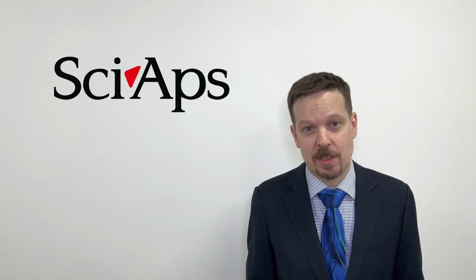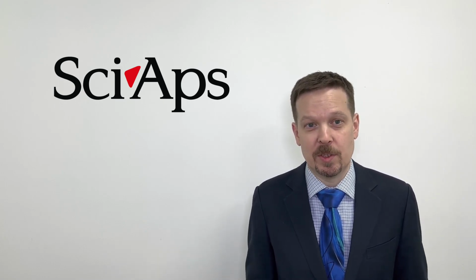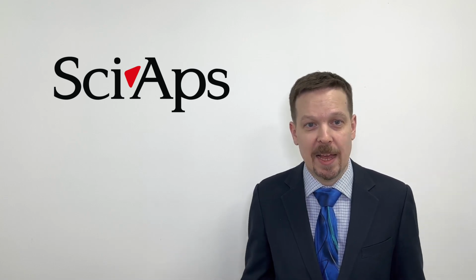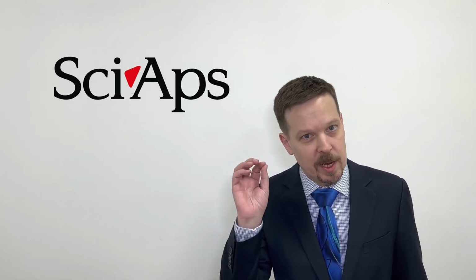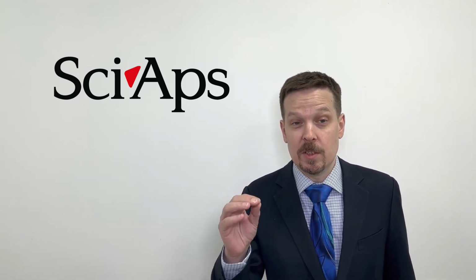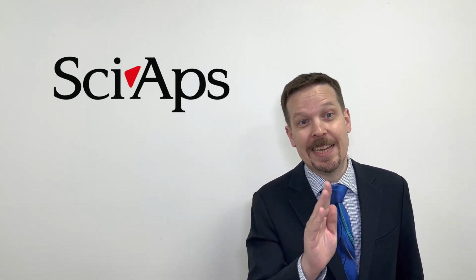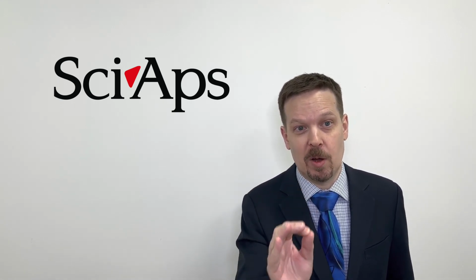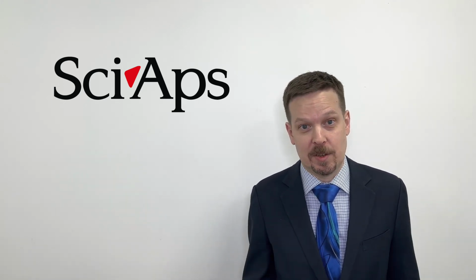The applications are absolutely limitless as far as what you can do with the instrument. It depends on what elements you want to see, how you want to focus the analysis, whether it's just surface. Do you want to just take one shot on the surface? Do you want to actually produce more cleaning shots and drill into the surface and see what's below a surface coating? The options are limitless.